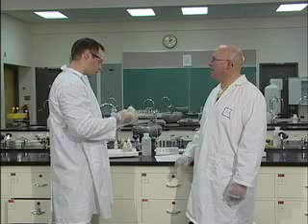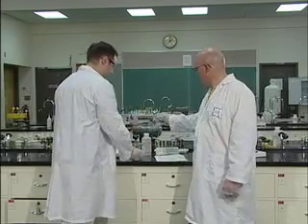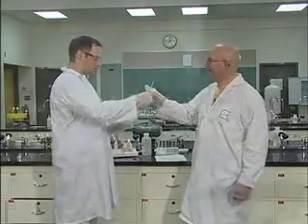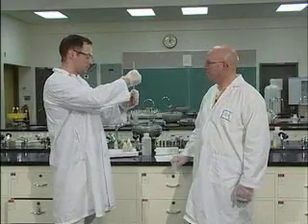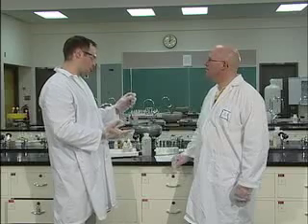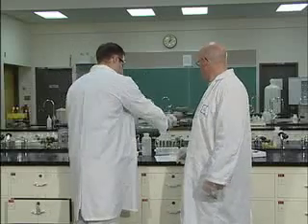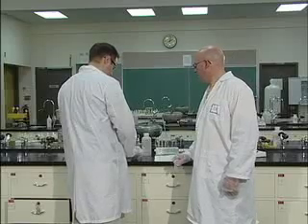Now, is it going to get warm too? Well, what you're going to do is first of all measure and record the temperature of this solution. So I'm going to take the thermometer out, rinse it with distilled water and dry it, and we're going to stick it into our hydrochloric acid. We'll notice that the hydrochloric acid will be roughly around room temperature. Now we're going to remove the thermometer, place it in our test tube rack, because you'll notice what's going to happen here.